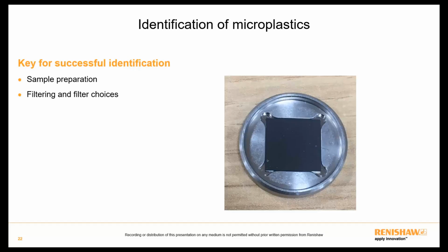For more complex cases, where significant competing material is also present, such as material removed from an animal, much more processing is required to ensure that this does not impact the ability of the Raman to identify the particles. Multiple sample preparation steps involving dissolving material and filtering several times is often necessary.